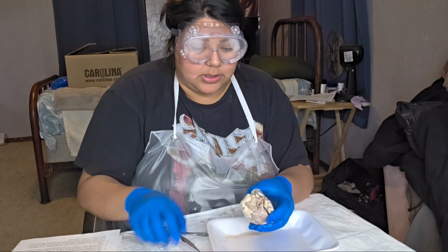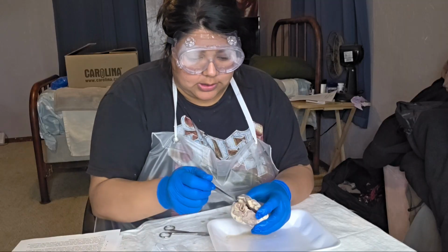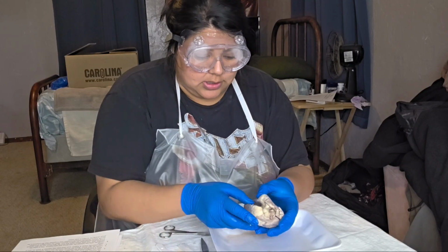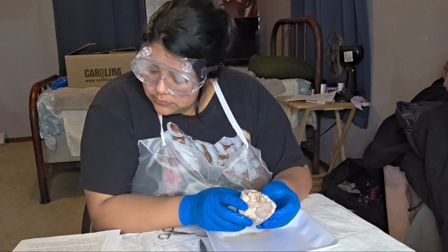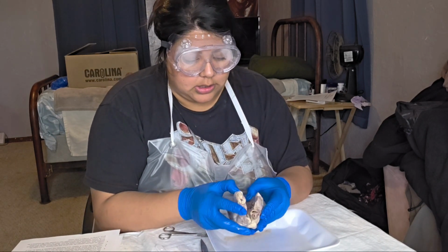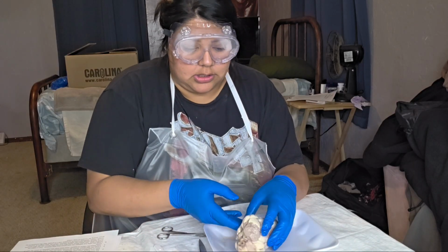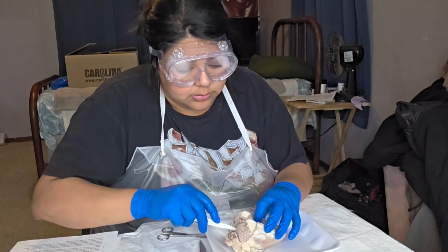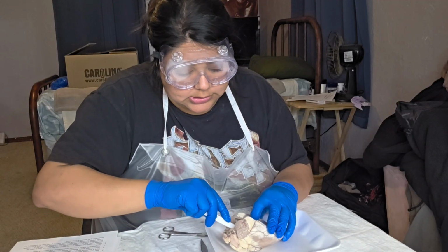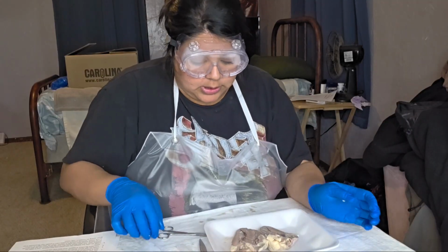Because it's flipped open, our inferior vena cava is going to be right here. We're looking at it from the back side. That's good to know. Again, the wall is much thinner on this side. I didn't say to cut through, but I'm going to cut all the way through because it's easier for me to see what I'm doing, and easier to remember what I'm on. Here we go.